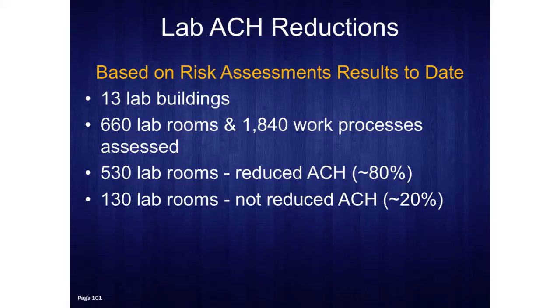So just in conclusion, we strongly believe that safety is not being compromised by our energy savings. Lab air change reductions need to be determined by a little bit of flexibility, and that's always an evolving and changing process. Containing contaminants at the source, actively involving EH&S to be a part of continuing risk assessment, and reassessing the labs when any changes do occur.